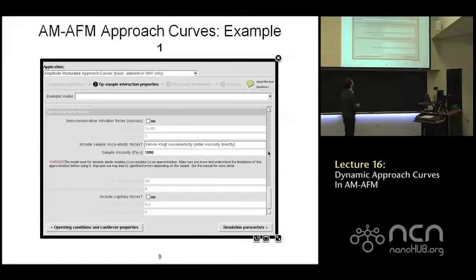If you scroll down to the portion of the panel which talks about non-conservative forces, you can include a viscoelastic force modeled by Kelvin-Voigt, and enter in a pretty big value of 1,000 here. Also scroll up on that page and make sure the Young's modulus is unity. It's one GPa. I don't remember the default value for that.